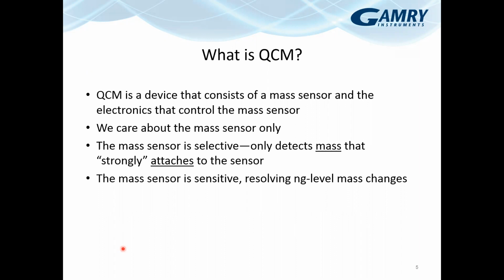As a biofilm researcher, or somebody who's buying equipment from a vendor, truthfully, you don't care about the electronics so much. We only really care about how that mass sensor is working and what it's detecting and where it's detecting it. And maybe within the context of this webinar, what part of the biofilm it's sensing. And so we can discuss that towards the end.